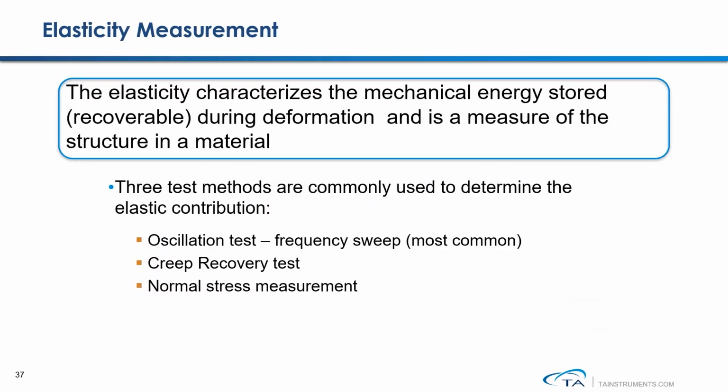So far, we have already talked about how we study the non-Newtonian property of structured fluid, how we measure yield stress, and how we quantitatively study the thixotropic behavior of structured fluid. At last, let's talk about how we design an experiment to measure elasticity of a structured fluid.